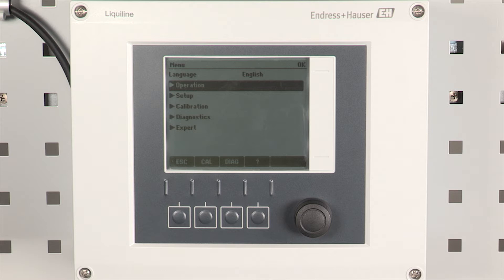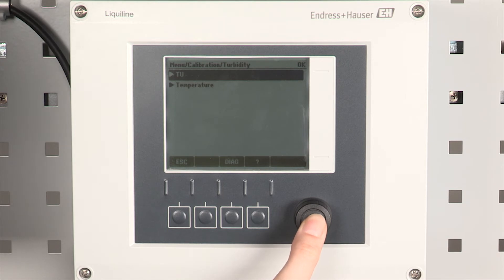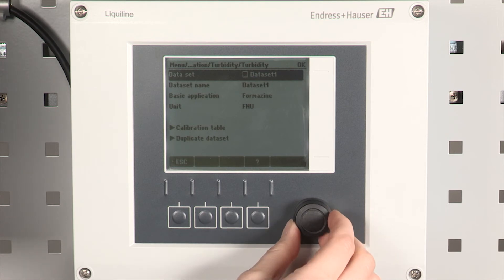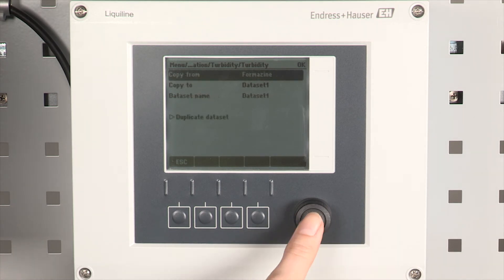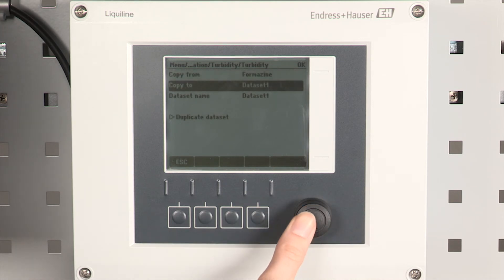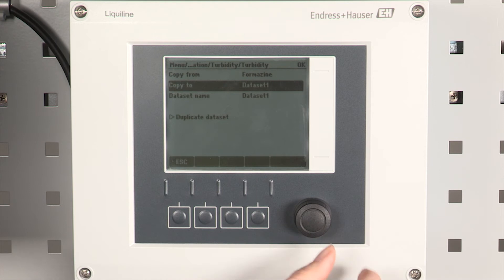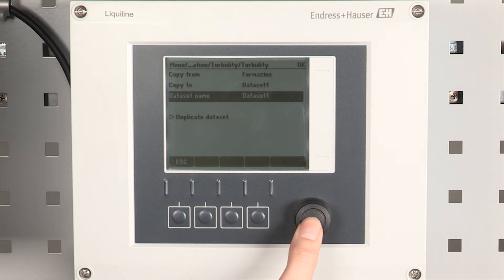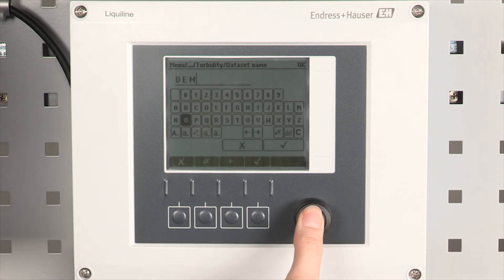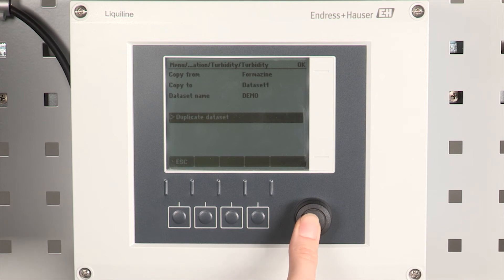The CUS52D is equipped with a so-called assembly adjustment to suppress or compensate wall effects. To activate the assembly adjustment go to calibration, your sensor channel, turbidity and select duplicate data set. Under copy from select the Formazine model. Under copy to select the data set and enter a name for it. Press duplicate data set.